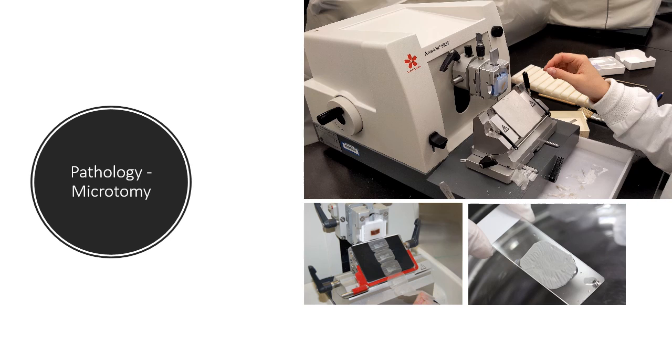The lab tech then proceeds to cut the desired amount of sections and drag them onto the warm water bath. A charged slide is then used to pick up the tissue from the water bath. The charge of the slide will cause the tissue to stick to it.